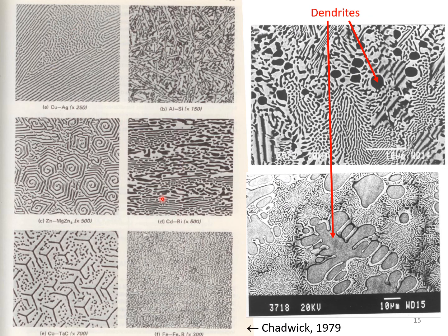So this just shows some examples of eutectics to show that they can have different morphologies, and this is two more examples, and both of these have got dendrites. Here's the periodic structure of the dendrites, the arms. That you can more easily see is a dendrite, and you can see the colonies, coming off of each.